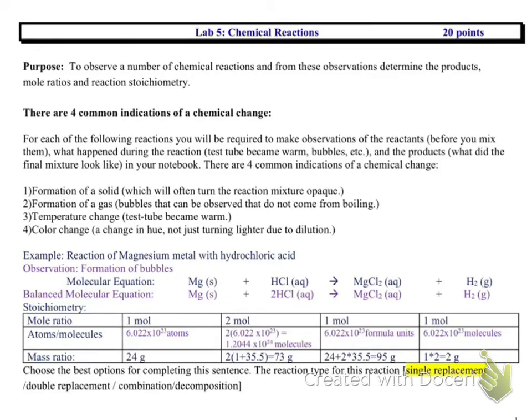So in this lab, you will do 3 different chemical reactions. You're going to write down the chemical equation, mole ratios, and stoichiometry for all the 3 reactions.